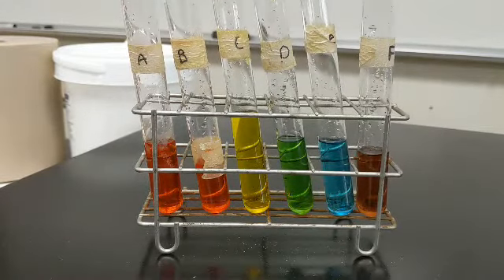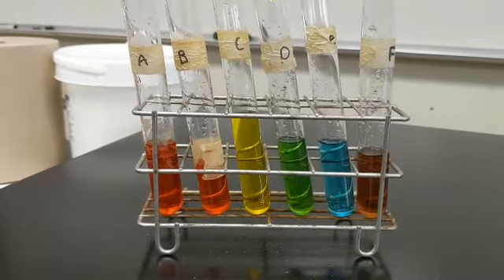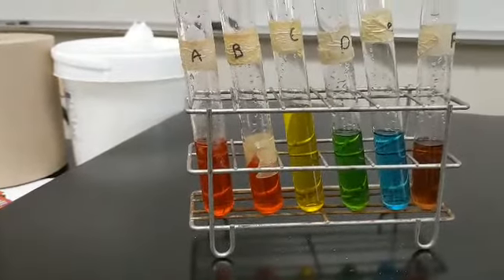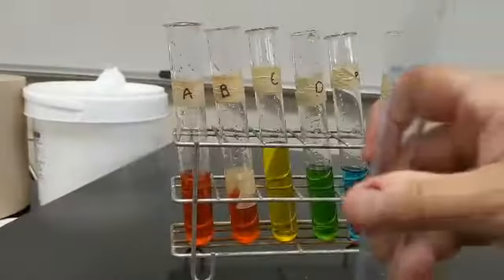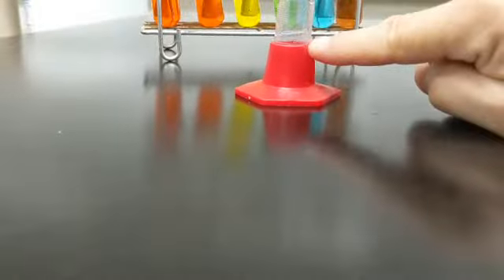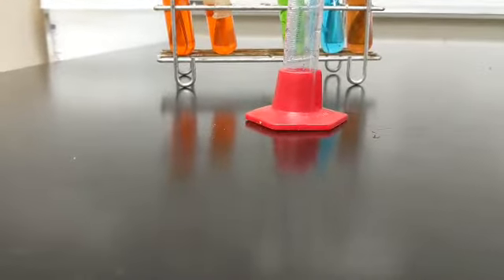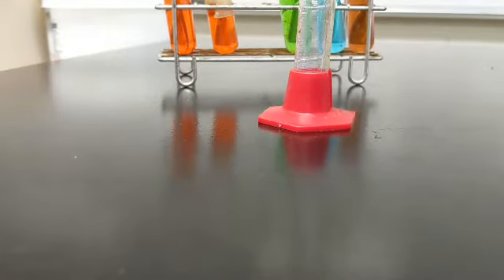Okay. So, step 9. From test tube C, take 3 milliliters and add it to test tube B. Okay, 3 is way down here. 3 is just a little bit. 3 is way down there. There.